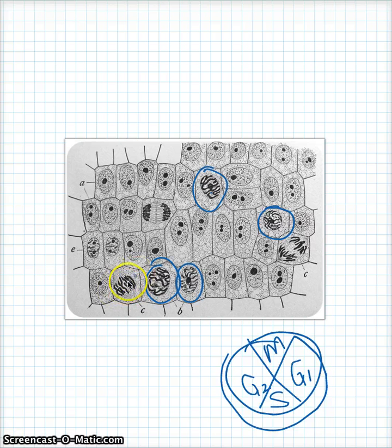This one is metaphase. And why isn't it prophase? Well, I can really see the spindle really clearly, and I can see that the chromosomes are starting to line up right in the center.